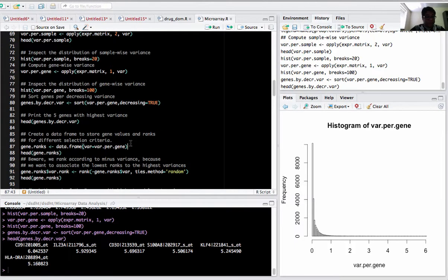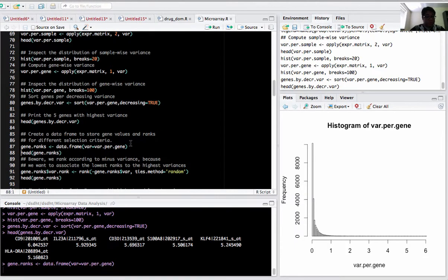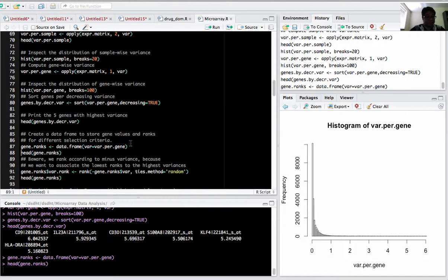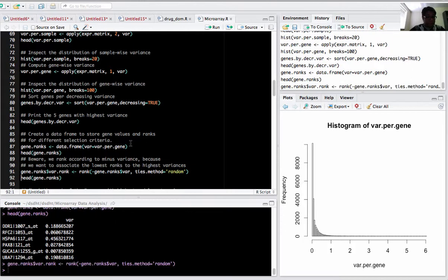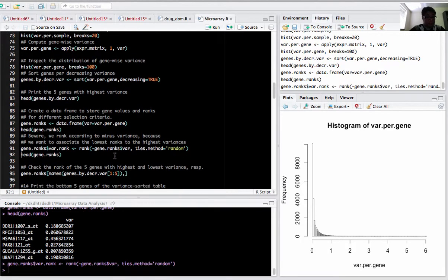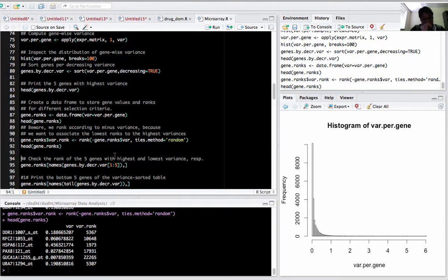Now I created a data frame, put the genes in the data frame. You can see I created it. These are not sorted, but we can rank them. We give ranks to the genes using the rank function. I used the minus sign to associate the lowest ranks to highest variance.